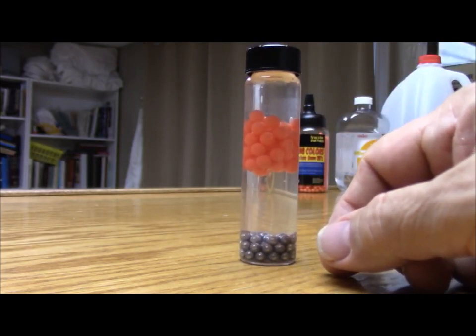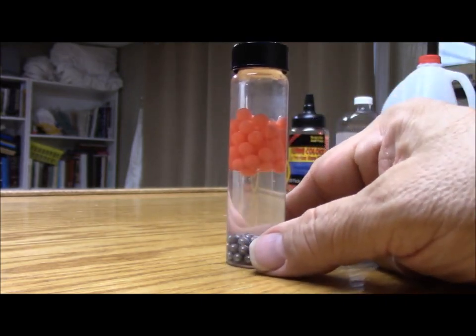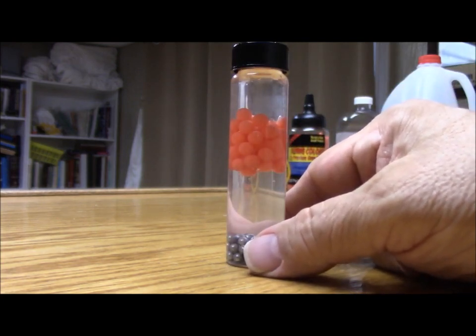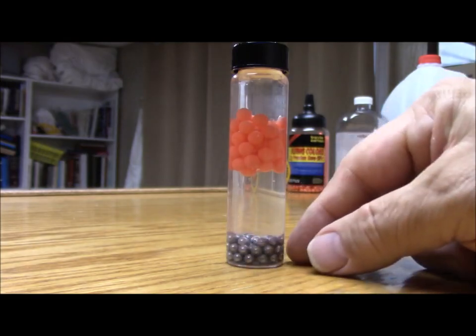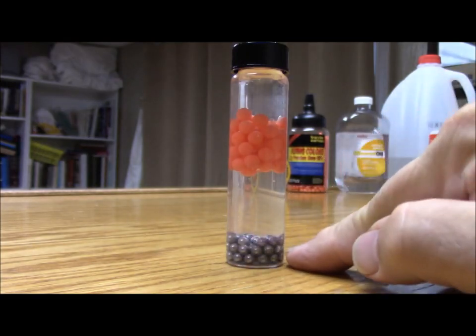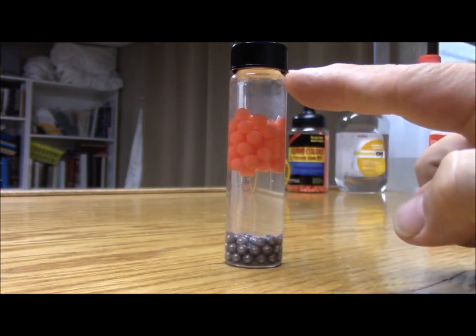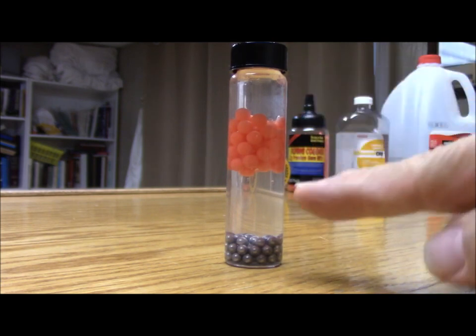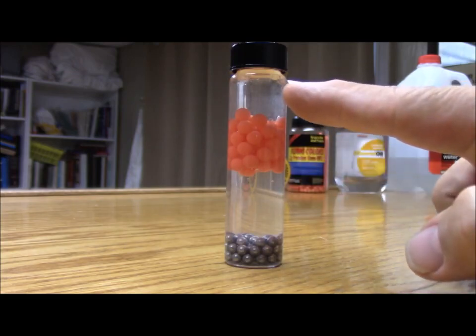Then on the back side, it says density is an intensive property of matter. In general, the more dense compounds of a mixture tend to settle near the bottom of the container, whereas the less dense compounds tend to float at the top. And there's another statement there, water is more dense than mineral oil.